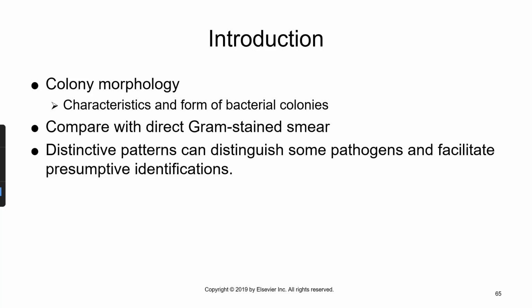There are some subtypes within different species that can do some pretty crazy things. So you think, no way is this Klebsiella, and then all of a sudden it turns out to be Klebsiella. So there's always those rare exceptions, and that's why we want to follow up with multiple ways that we're confirming the identity of the microorganism before a definitive diagnosis can be made.